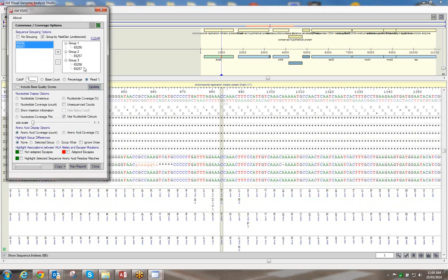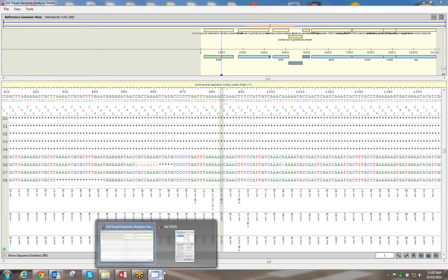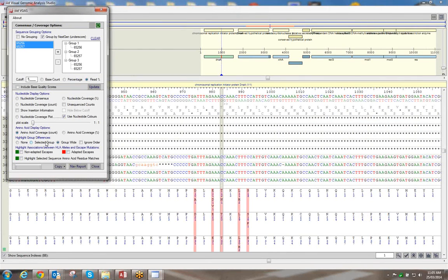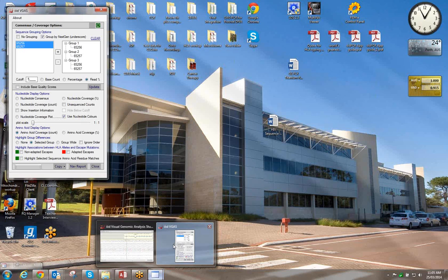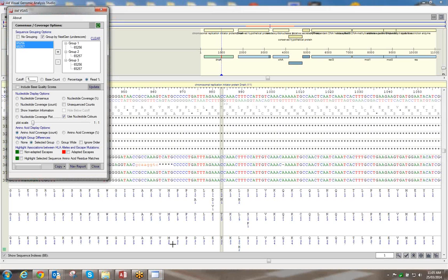There are a lot of things to do here, and you're probably confused at this point. But once you test it out yourself and have a play with it, you'll have a lot of questions. You definitely need time to play with it. Maybe start with something a little bit smaller than H. pylori to get used to it.